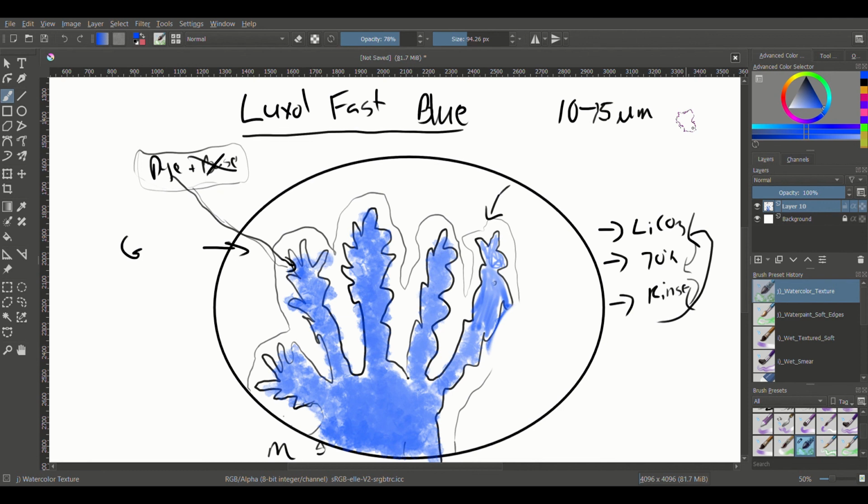The text that I'm using covers some of those combination stains, though I am going to refrain from going over all of them, because it's essentially just do the stain that we know and then add another stain on top of it. And you just have to look at the mechanisms and see which one would be disrupted by which to know which order to go in.